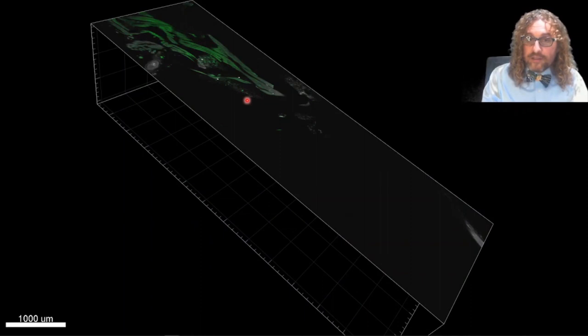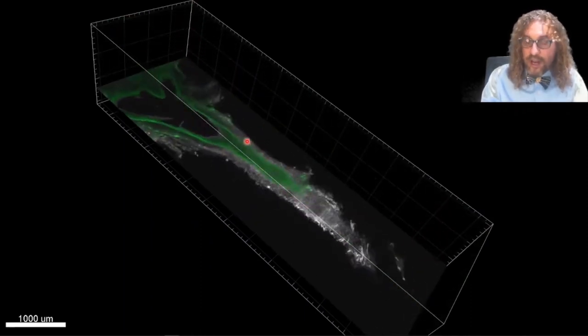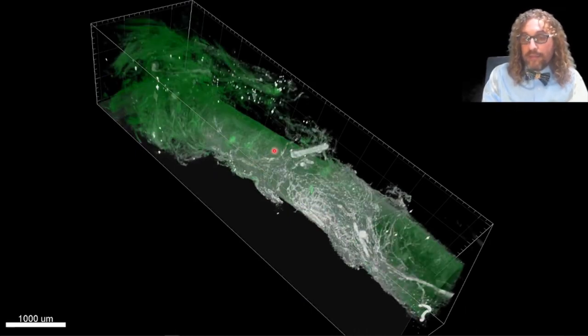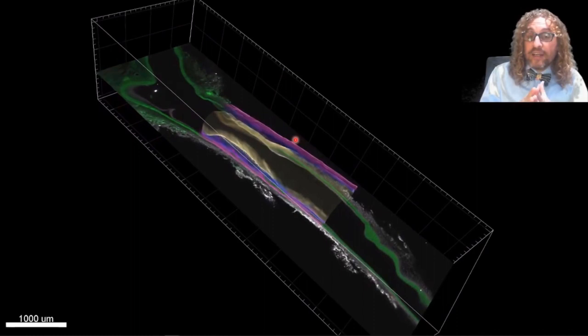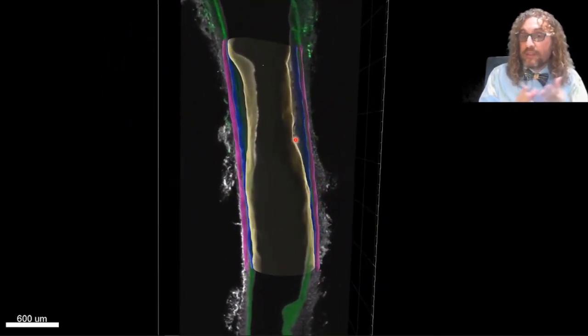Take a look at this space here where you'll see neointimal hyperplasia. There it is, and a narrowed lumen is going to come back so you can see again. And then it's going to highlight where the site of stenosis is and the neointimal hyperplasia. This was so beautiful that immediately we decided to actually come up with a method to quantify stenosis using LSFM.